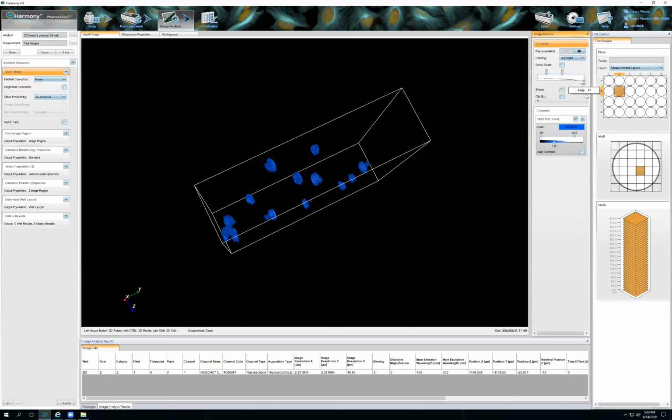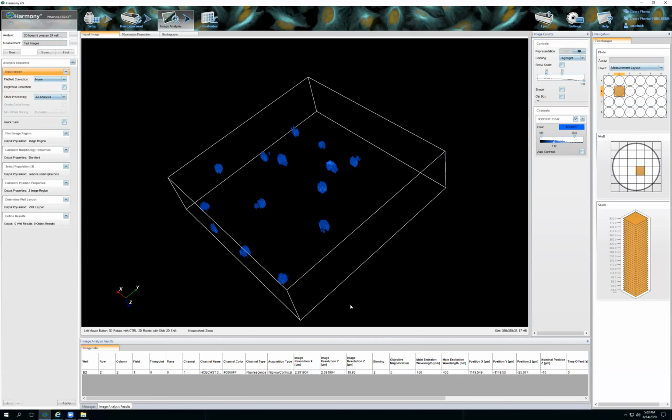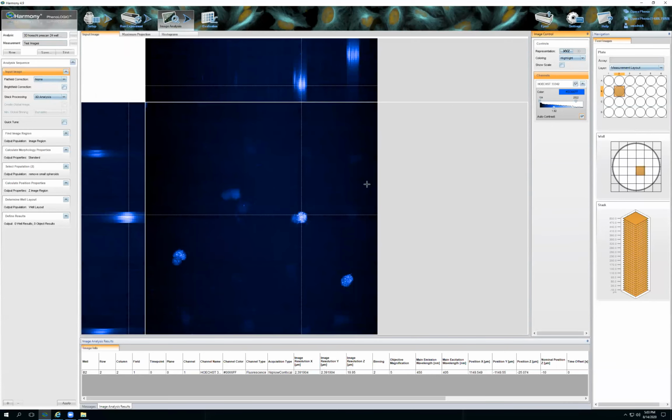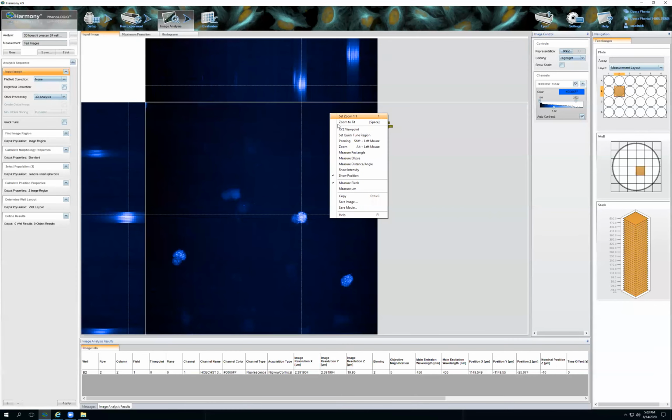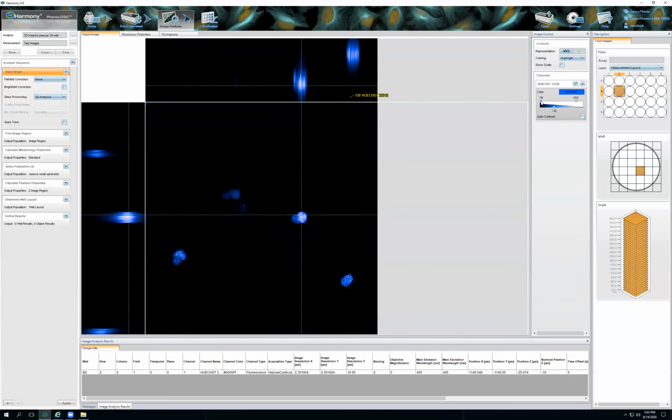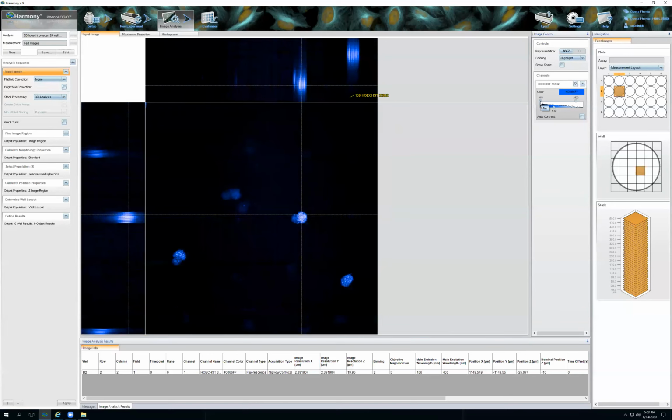And there's different things. If you right click help, this will walk you through what everything else over here means. I'm gonna leave it on this view because this is what I find the best. When I put back on auto contrast, again, if you right click intensity, you can see that the background intensity is around 150. So if you want to bump this up to like 150, just move some of that background to make it a little bit crisper, you can.